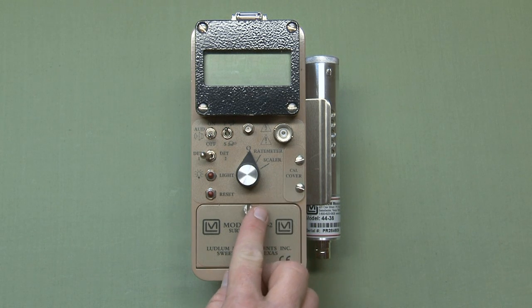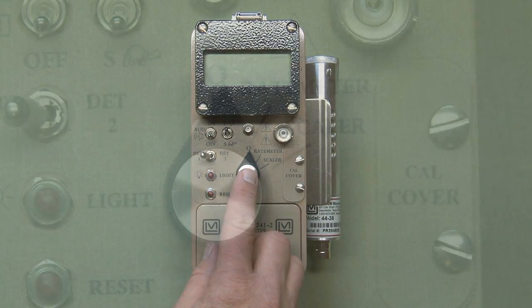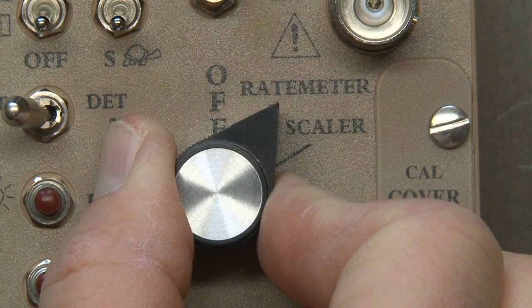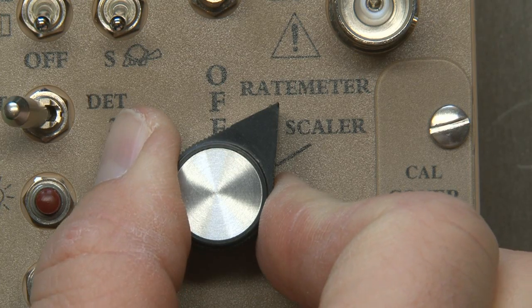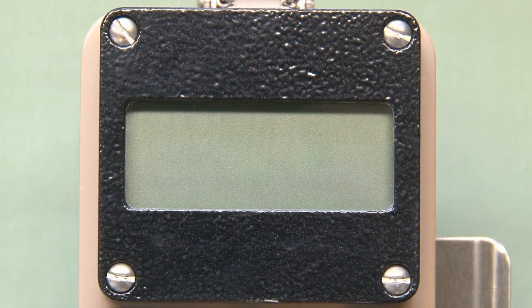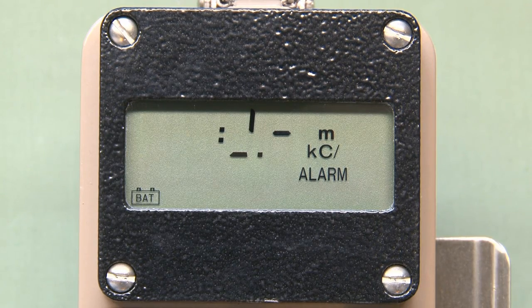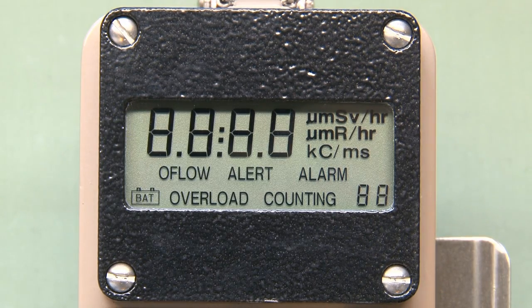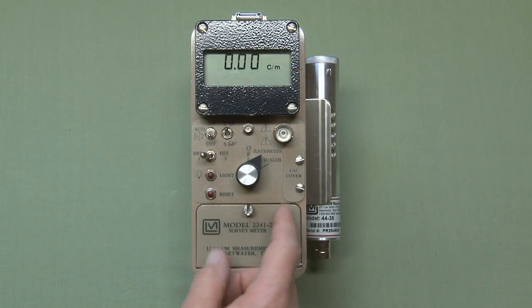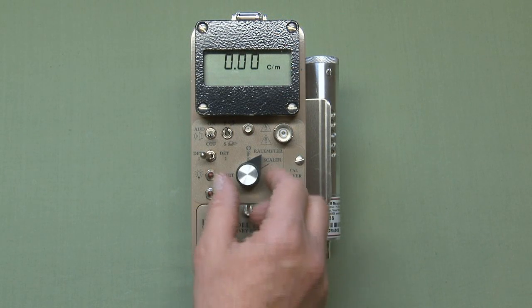The instrument has a three-position switch to select the operating mode: off, rate meter, and scalar. Once switched on, it goes through its startup sequence. In general use, the meter will be used in the rate meter position. I'll discuss the scalar function in a little bit.